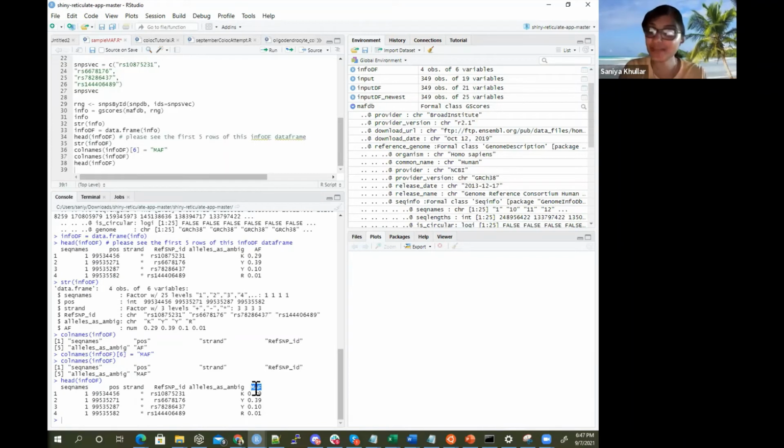So I'm just trying to show you guys that you can totally convert it afterwards into a data frame. Please don't be intimidated by it if you're not sure what the object is. You can just convert it to a data frame or a table or a data table, whatever you're able to work with, and then you can just continue working with that.